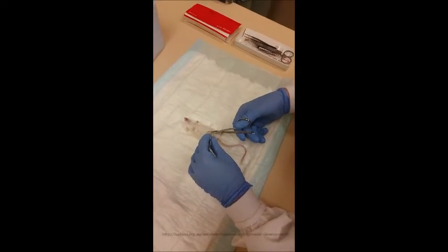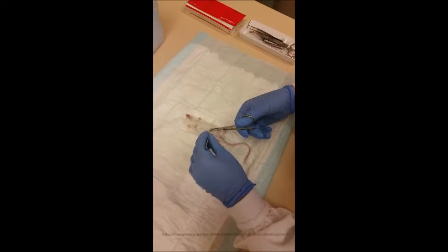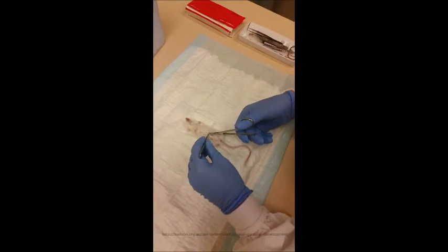The first thing to do is make a cut up along the midline of the mouse. You want to make sure you cut through the muscular body wall and just cut straight.